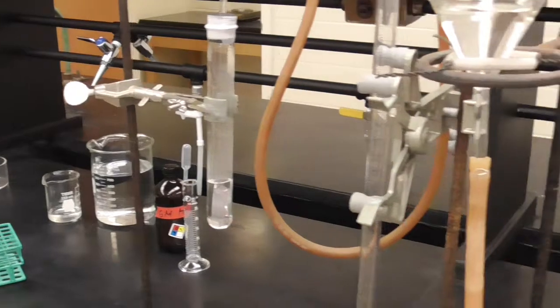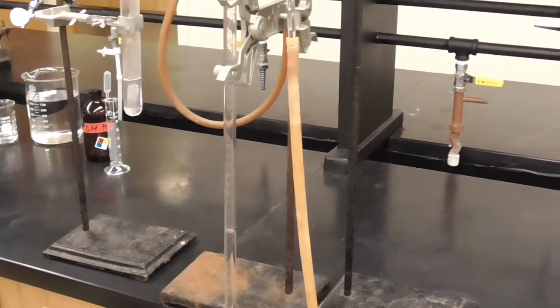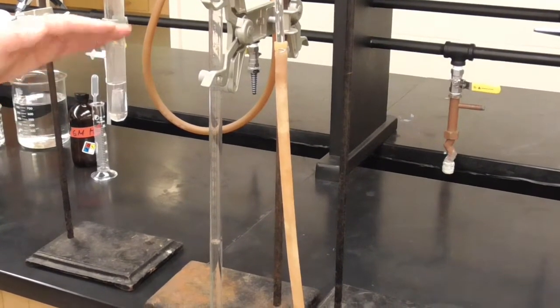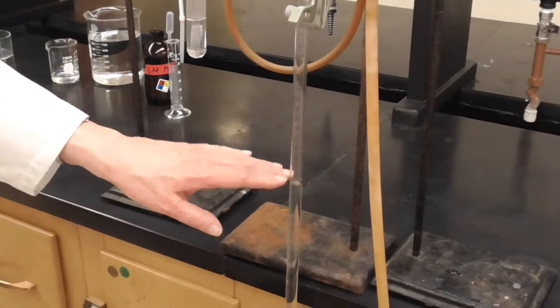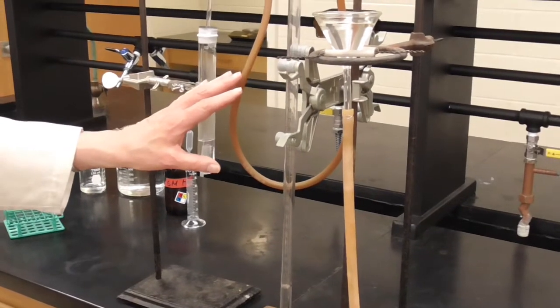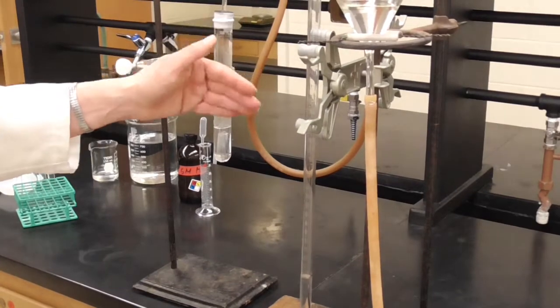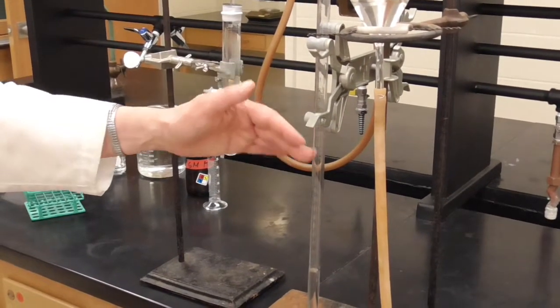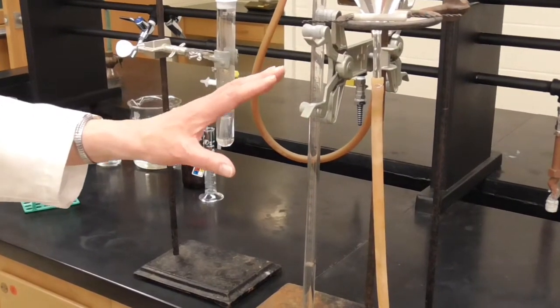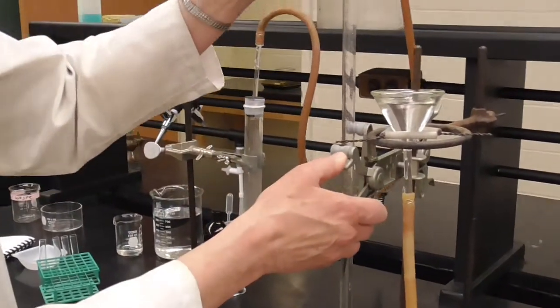Okay. Now, at this point, we need to again determine that the pressure inside of the apparatus is the same as that outside. At this point, because the level in the burette is lower than the level in the funnel, that means the pressure inside the apparatus is higher than the pressure outside. But because we don't have a pressure sensor inside the apparatus, we don't know what that pressure is. And so the only way we will be able to know what the pressure is, we have to, again, make the two levels equal with each other.